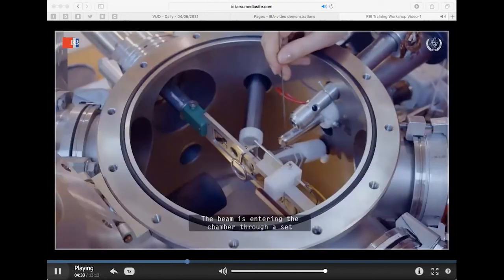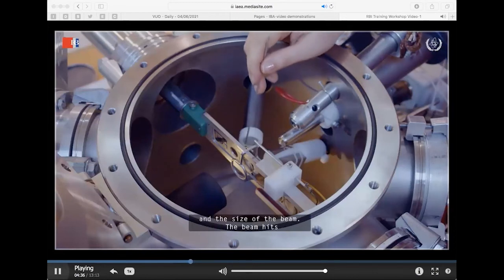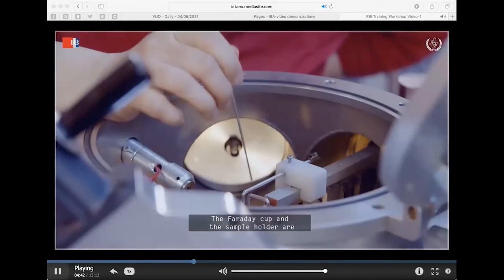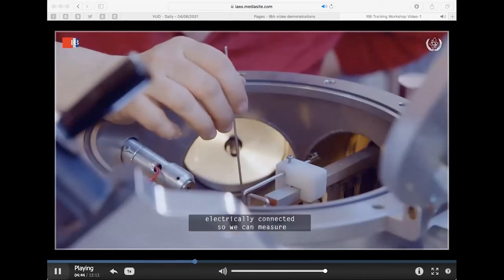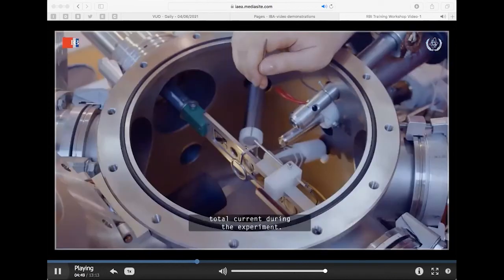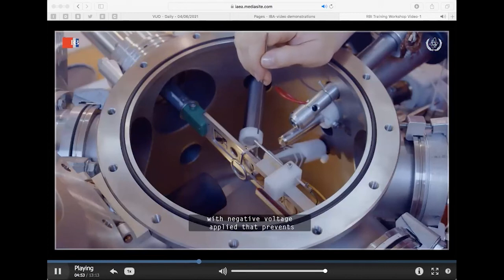The beam is entering the chamber through a set of collimators that define the shape and the size of the beam. The beam hits the sample, but in some cases it can pass through the sample and enter the Faraday cup. The Faraday cup and the sample holder are electrically connected, so we can measure the total current during the experiment. Around the sample holder, we have a wire with negative voltage applied that prevents emission of secondary electrons.